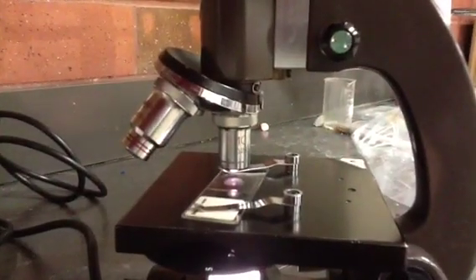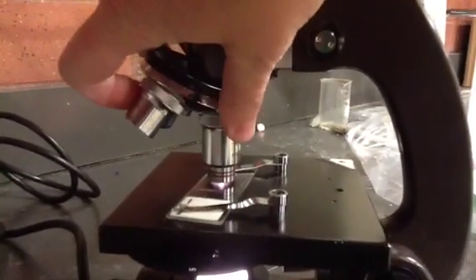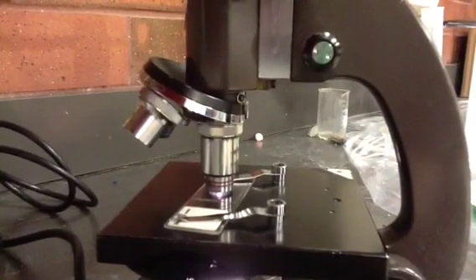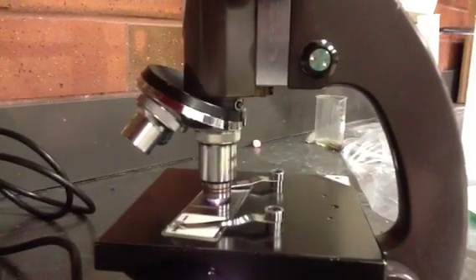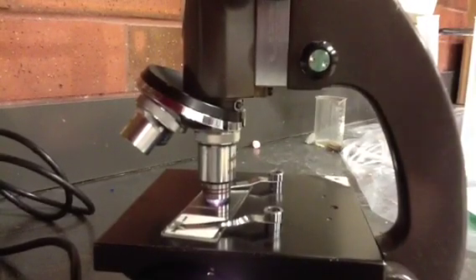Next, you'll rotate your microscope to the high power. Turn the objective lenses so that the high power faces down. Notice the high power lens is almost touching the slide. You have to be very careful when using this power because you can crack the slide or you could crack the lens. These lenses can't be replaced. You'd have to replace the whole microscope if it gets broken.